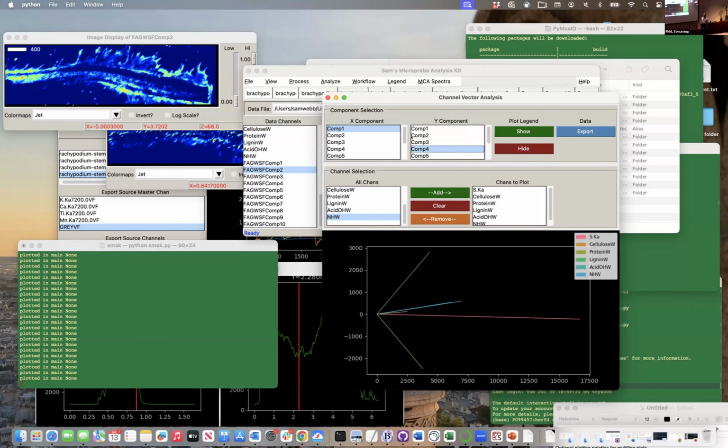So it's not as great for seeing everything in clear daylight. Like a messiah, like, oh, everything worked great. There's all these great correlations, but it's a good way to see, okay, I can at least see how these things do correlate a little bit, and it presents, again, what our challenges are for even getting good data.